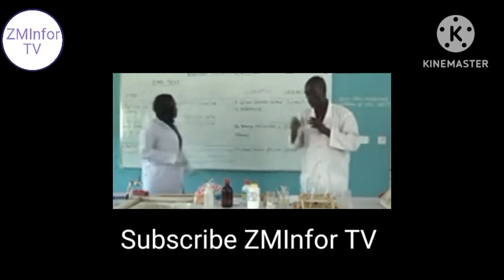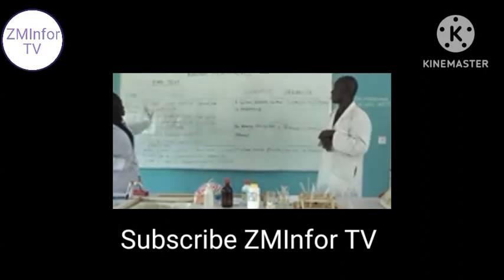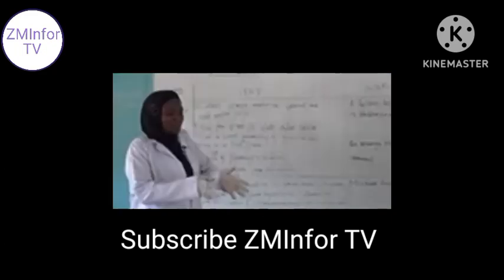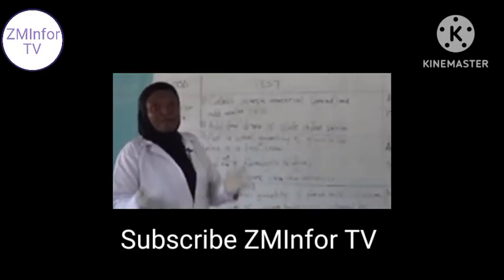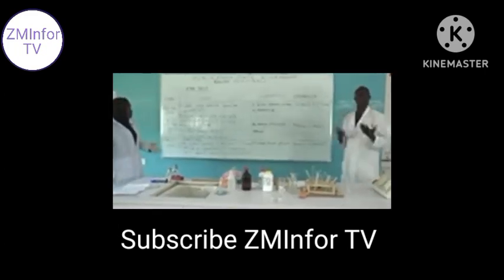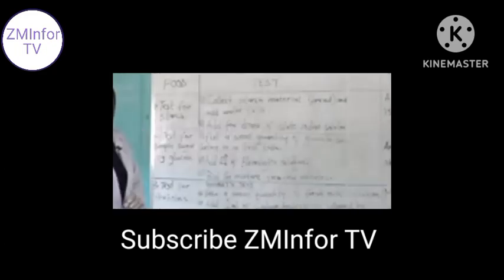So let's go back to the table. The first column, test for starch. Collect starch material. It could be bread, and for this particular class we have used bread. It could be yam, it could be any other starchy food. We diluted it, we put some water in it to have a solution.